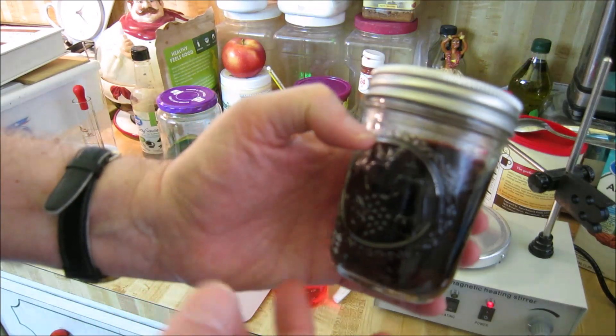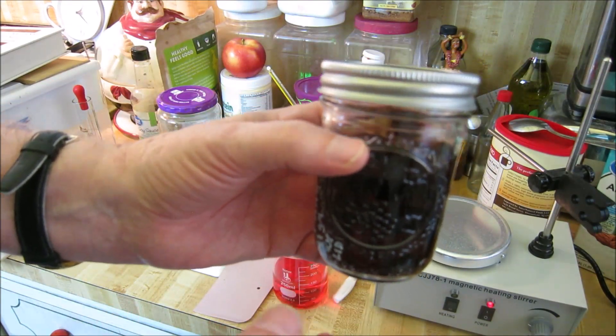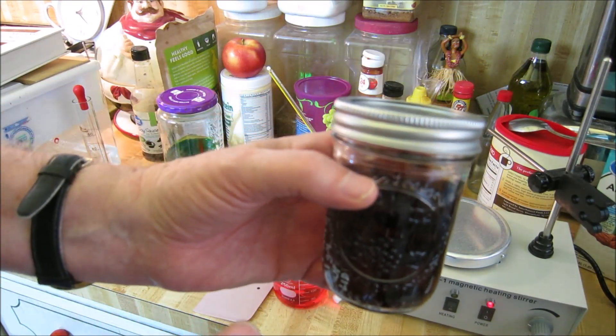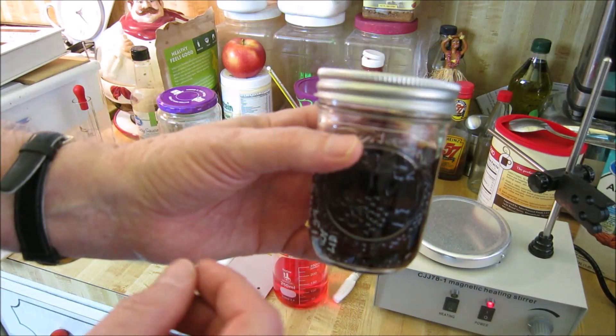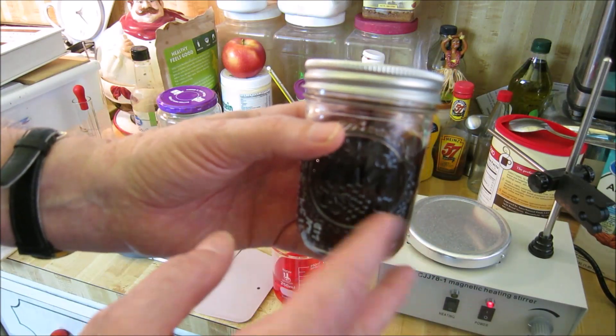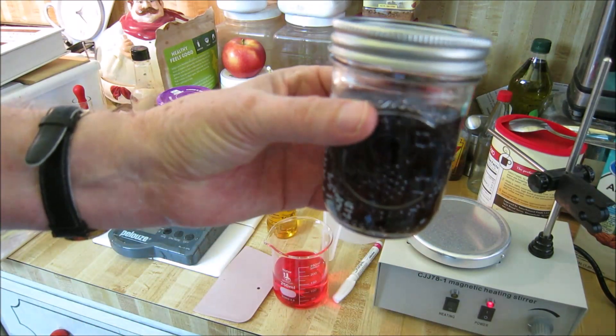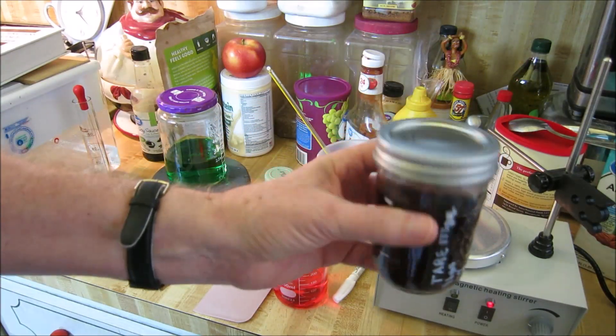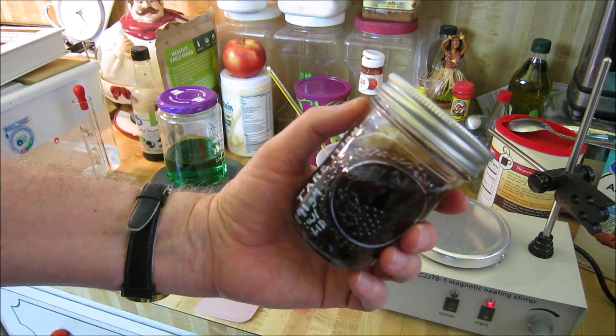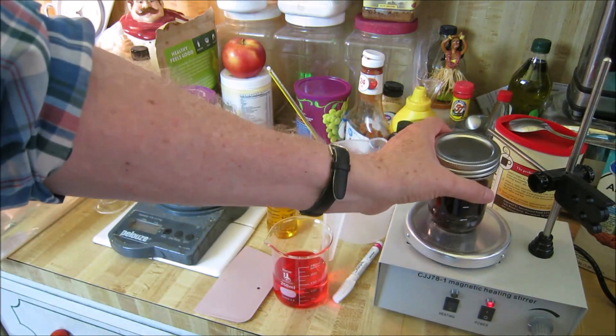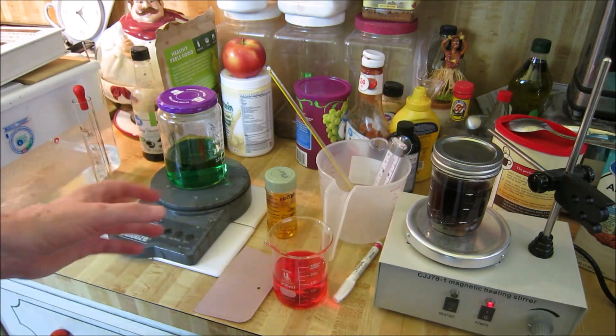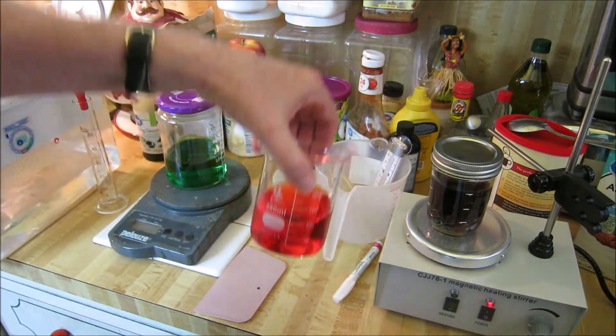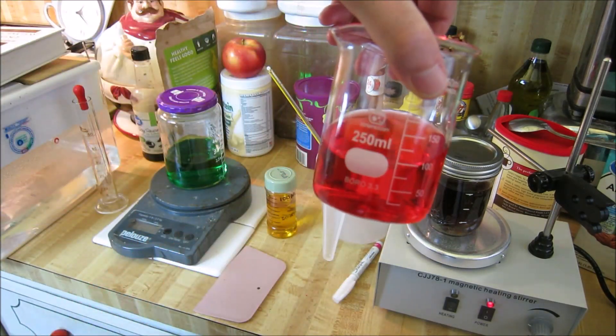Like I said, you can't introduce flame to them or really strong reactions where you might have something that would stress the glass. But you can do a lot of chemistry experiments with plain ball jars. If you can't get a hold of your borosilicate glass.